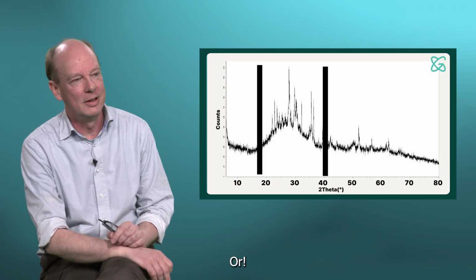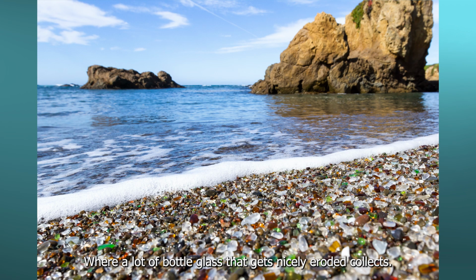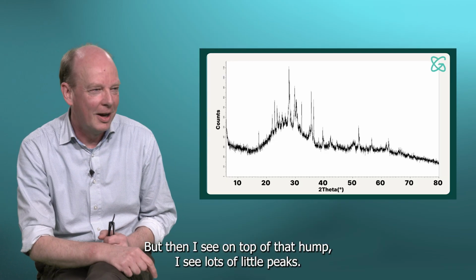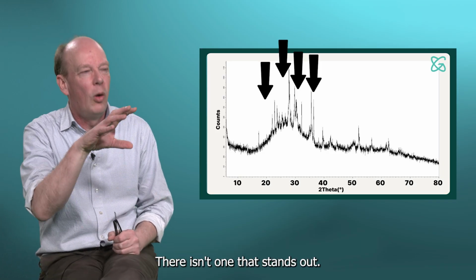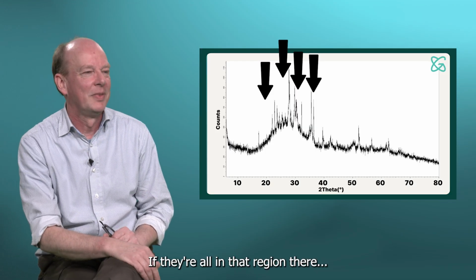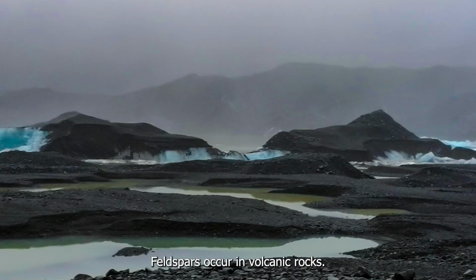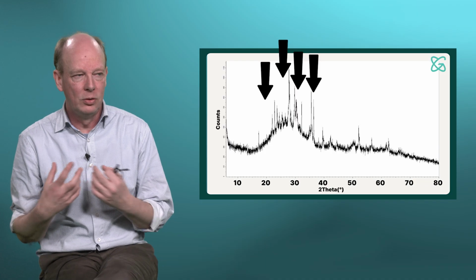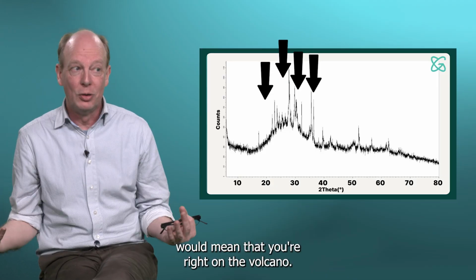Right, or there's something called sea glass, that people collect, where you have beaches where a lot of bottle glass that gets nicely eroded collects. So that's very collectible. But then I see on top of that hump lots of little peaks. Now there's too many for me to identify them individually, but there isn't one that stands out. If they're all in that region there, I think they're from a mineral group called feldspars. Feldspars occur in volcanic rocks, and because these feldspars and the glass alter very quickly, so they break down very quickly, the fact that they're preserved would mean that you're right on a volcano.